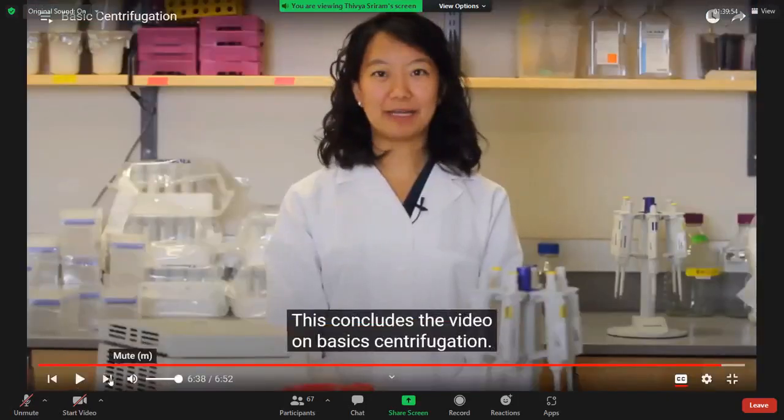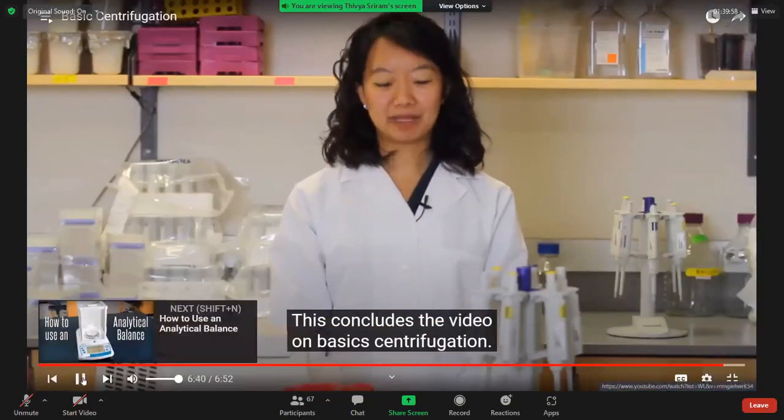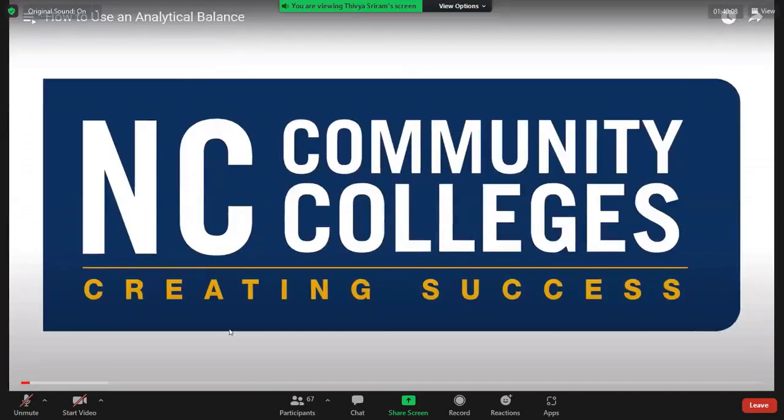This concludes the video on basic centrifugation. Up to now, you have seen how to use the centrifuge apparatus. Here, after the centrifugation, you are able to get the solid particles from the liquid.